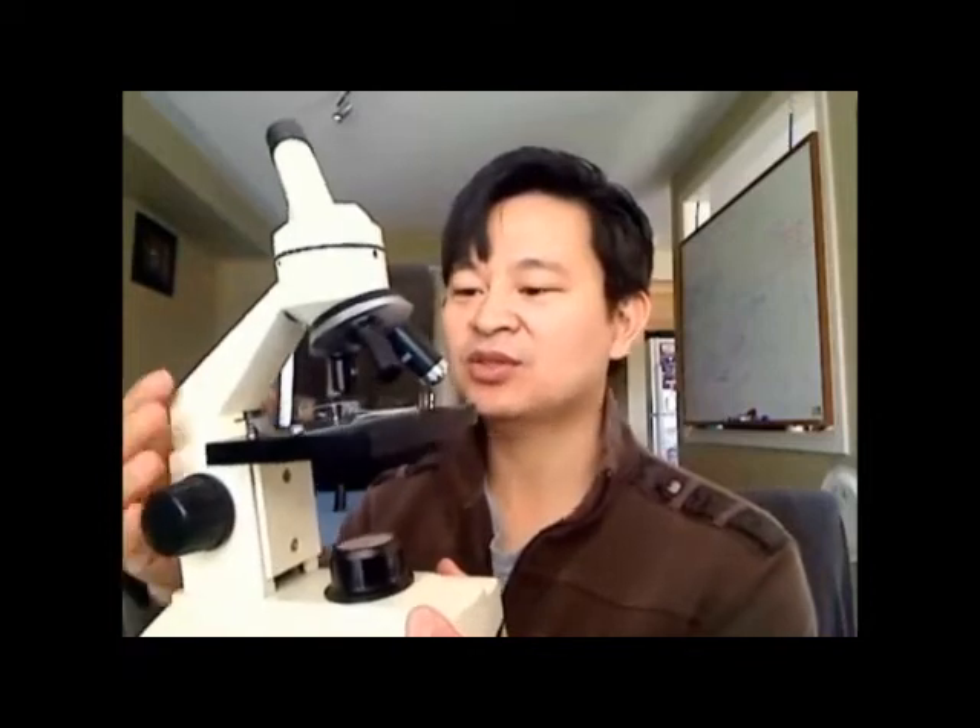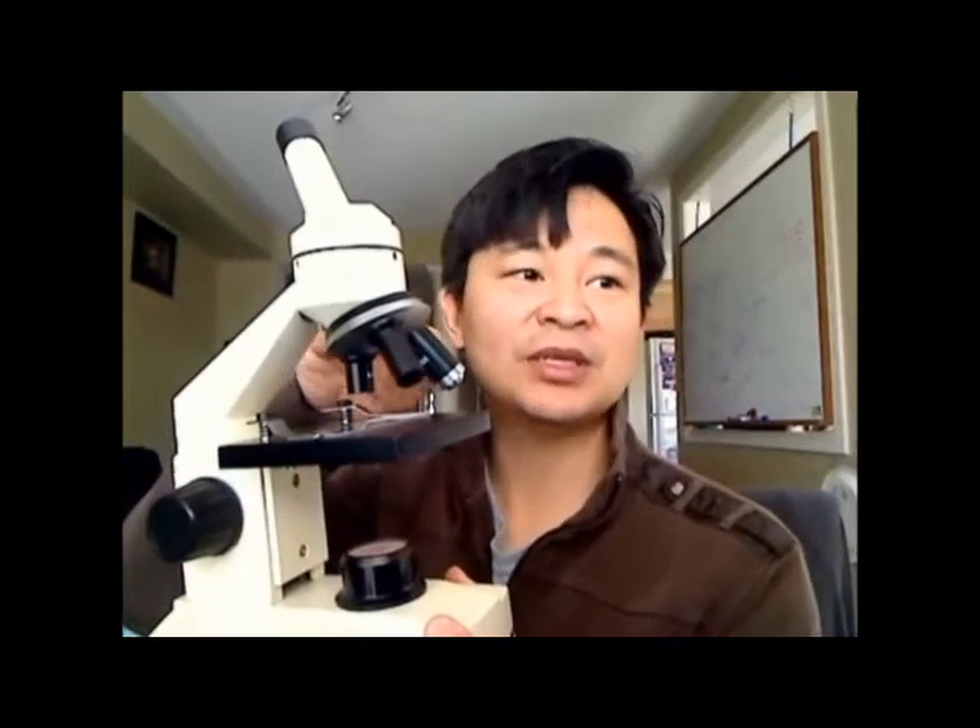An important thing is to get a really good microscope. This is a 400-times microscope. How do I know it's a really good one? Because this is actually made of metal — a metal structure framework. You have a good objective lens made of glass, and the ocular lens is also made of glass. You have a good base with a diaphragm to adjust lights, and a lighting system with a real light bulb you can turn on and off for intense light.